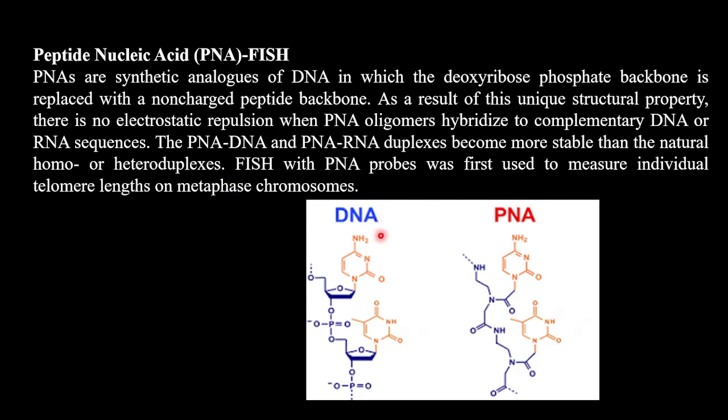So whenever you know that stability is the concern and probes are not binding with high stability to your particular target sequence, you can go ahead and use the PNA or the LNA probes. But there are very few companies which are making these probes, by the way.